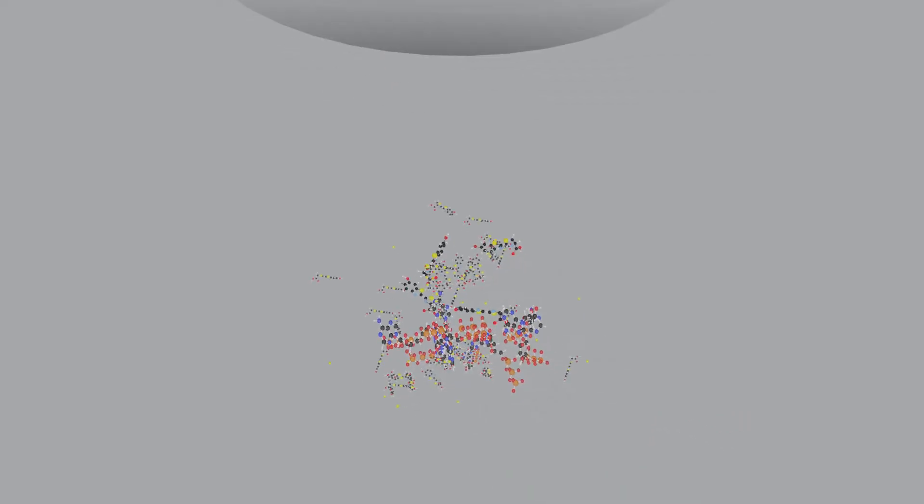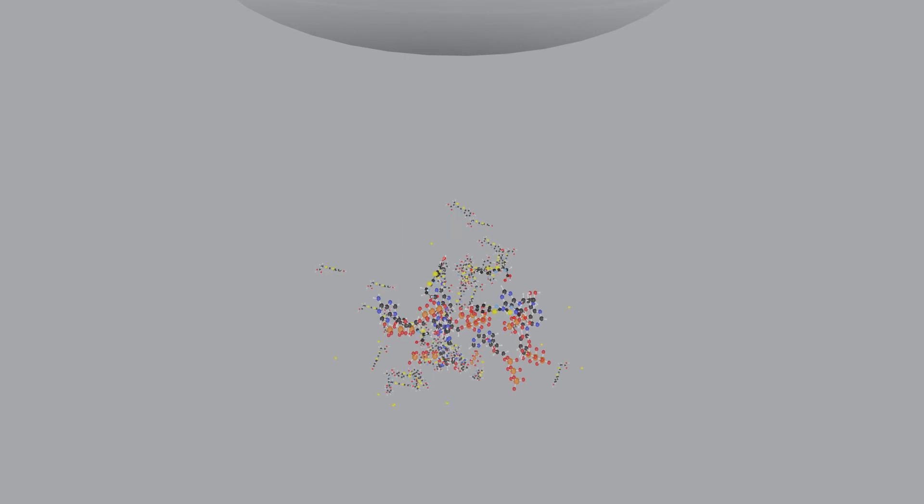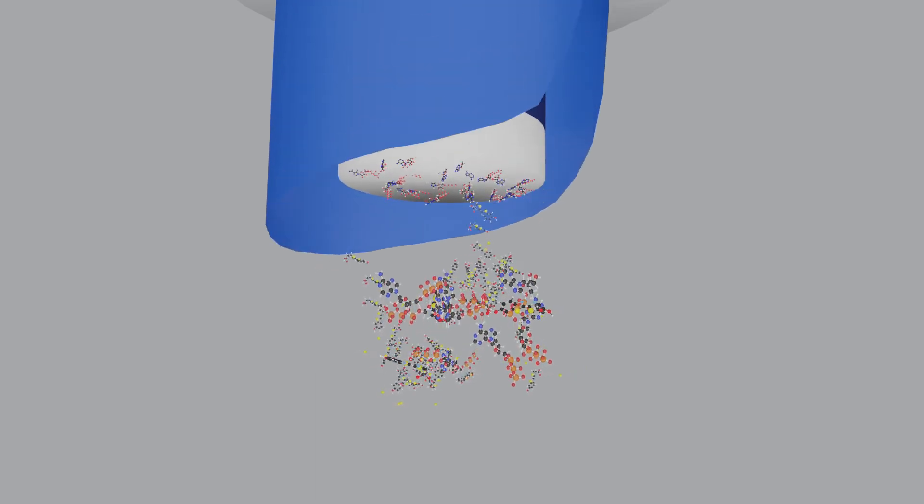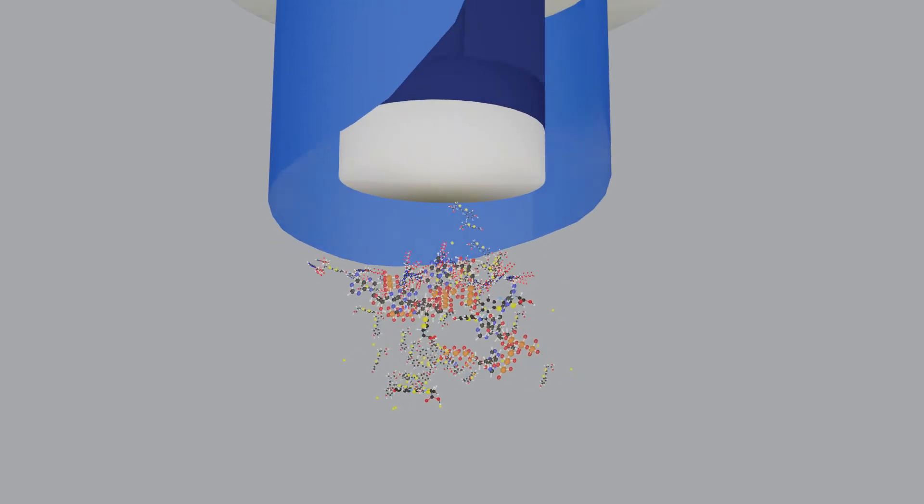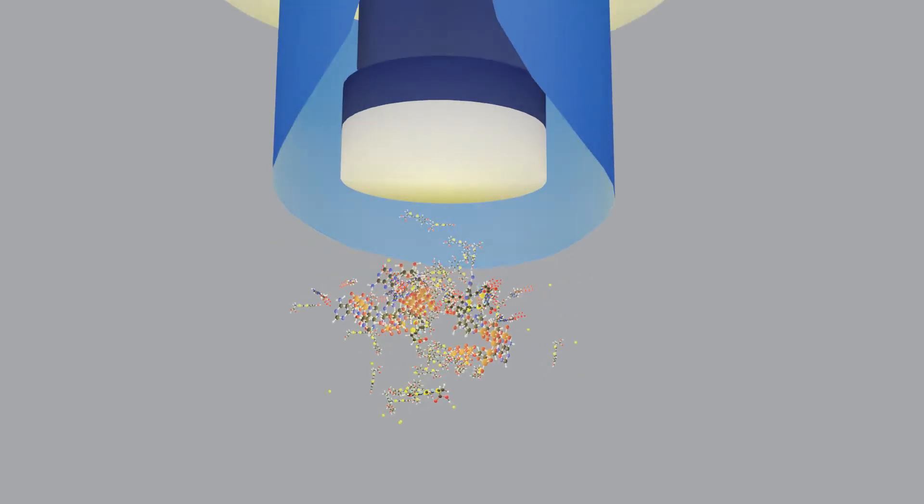The AccuPoint Advanced system includes a uniquely designed sampler that collects ATP from a surface. When combined with the luciferin substrate and luciferase enzyme contained in the unibody, the ATP activates, producing light.